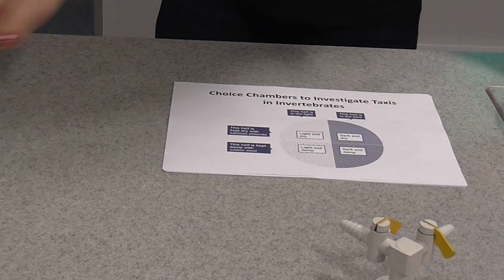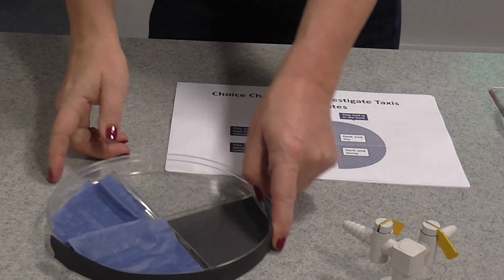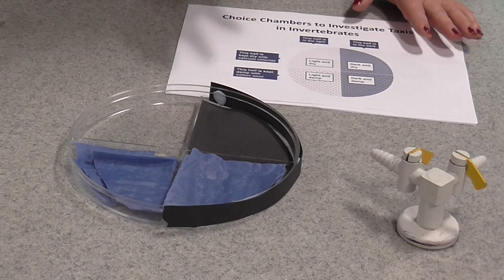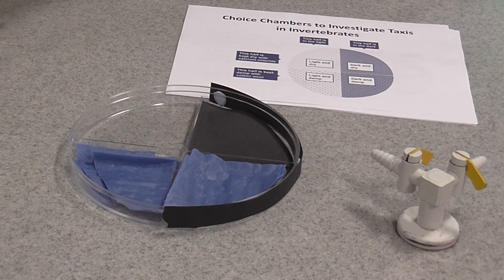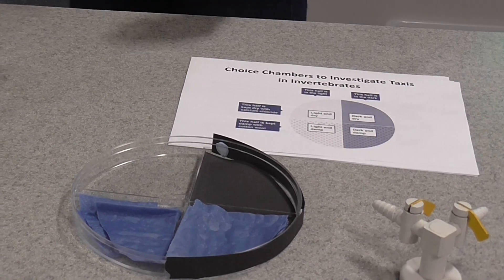Now here's a choice chamber that I've prepared earlier. What I've done, you can see I've set it up in this way. I've got half of it that's going to be in the dark and I've done the same with the lid by putting a piece of black paper in there. The lid will go on there.